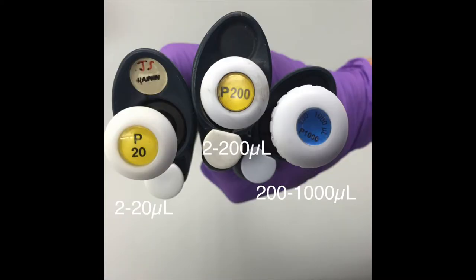There are many different sizes of micropipets, but today we will be discussing three of them. The 2 to 20 microliter pipet, indicated by the P20. The 2 to 200 microliter pipet, indicated by the P200. And the 200 to 1000 microliter pipet, indicated by the P1000.